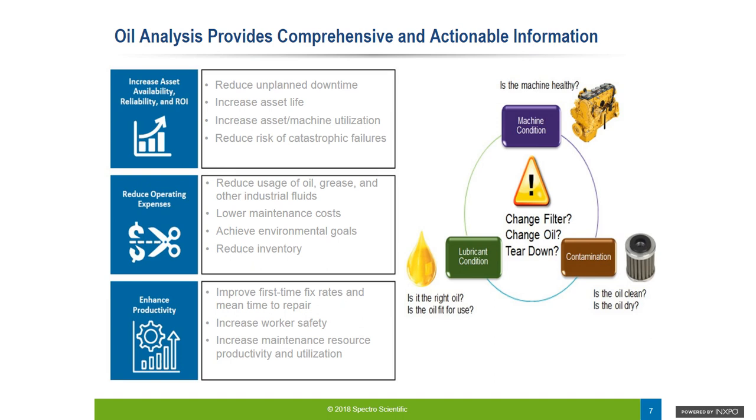Analysis of in-service oil samples can help you determine if the machinery is healthy by looking at things like wear particles in the oil, looking at the physical and chemical properties of viscosity and acid, and if there's any external contamination from dirt or sand, water, or other foreign fluids. The key value in an oil analysis report is that it can provide a recommendation to the maintenance team, like filter the oil, possibly change the oil, or no, it's okay to continue and have an extension on the oil drain interval, or some other maintenance action on the machine.